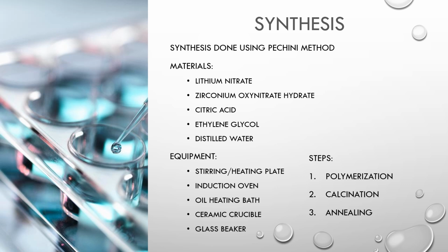distilled water. The equipment used was a stirring and heating plate, an induction oven, an oil heating vat, a ceramic crucible, and a glass beaker. And the steps for the synthesis were the polymerization, calcination, and annealing.